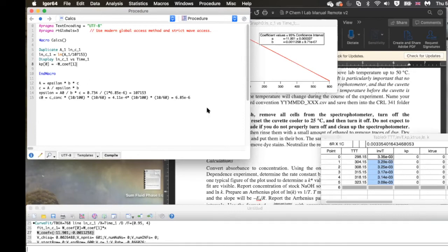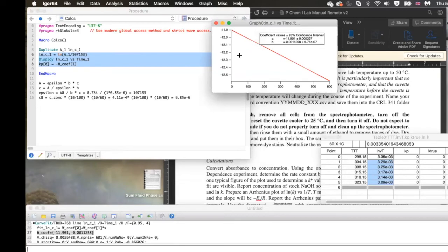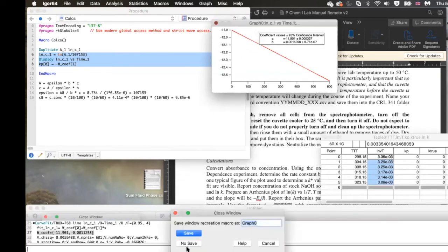Now, why have I typed all this in here? Because if I just do this, I'm going to have to do this 6 times, right? So now I can just copy and paste. Watch this. I've already got the wave, I don't need to create that wave again.